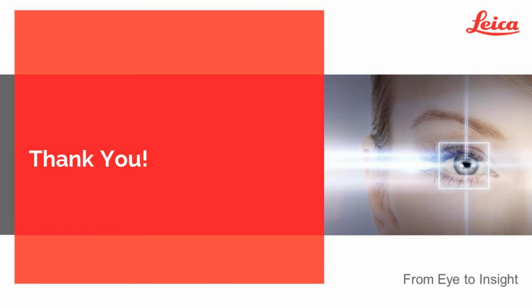Our first question asks, what is the difference between machine learning and deep learning? All right, yeah. We've been hearing a lot about both of these terms, machine learning and deep learning, and they both belong to the general concept of AI. The difference is that in machine learning, you provide a couple of examples, and it works on smaller scale images and smaller scale data sets. It involves having the human being there, identifying the features that they would like, and then it runs through a specific set of operations to come up with the rules.